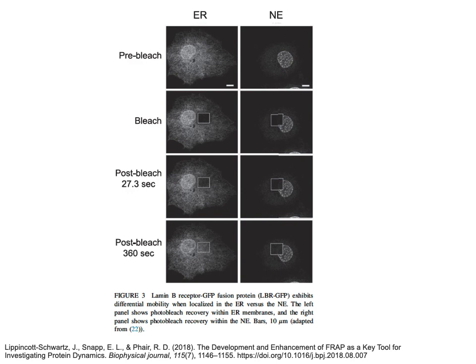So if we look at pre-bleach and then bleach, and then for post-bleach they select 27.3 seconds. I had mentioned, I don't know why that's a kind of weird time, why they didn't pick 30 seconds. I imagine someone just pushed the button a little too early and they just wanted to make sure that it was accurate. Maybe something magical happens at 30 seconds and they wanted to get up before that.